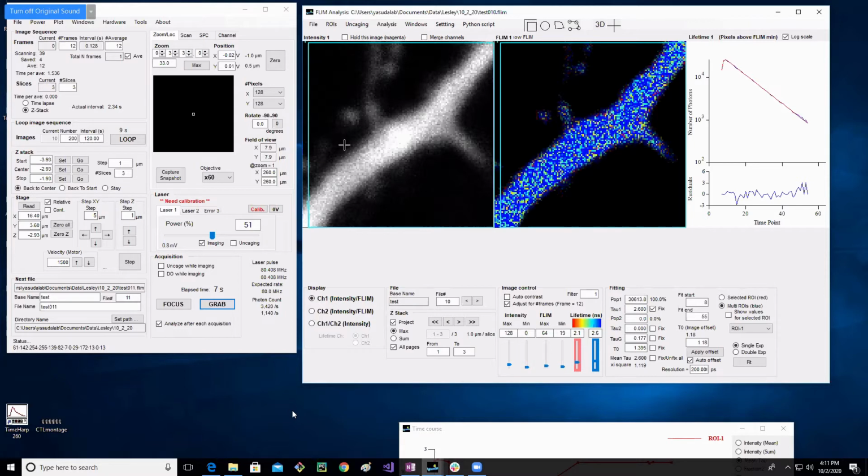So if you're doing something like structural plasticity on a secondary dendrite, you might use a Z-stack of slices, for example. The other way we use slices is not for a Z-stack, but for something called a time lapse, okay? The slice is the same thing. One slice is still going to be equal to a set of frames, okay? So in this case, again, a set of 12 frames that are averaged will be 1 slice. And then I can decide, instead of my slices being in Z, they're going to go in time, okay?